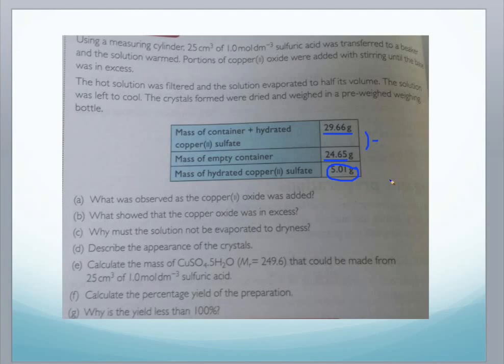So question D, describe the appearance of the crystals. So again, we saw them on the previous page. They're blue. You can either describe them as diamond-shaped or rhombus-shaped. Either one is fine. So then question E is asking us to calculate the mass of the hydrated copper 2 sulfate that could be made from. So they're asking us to calculate the theoretical value.